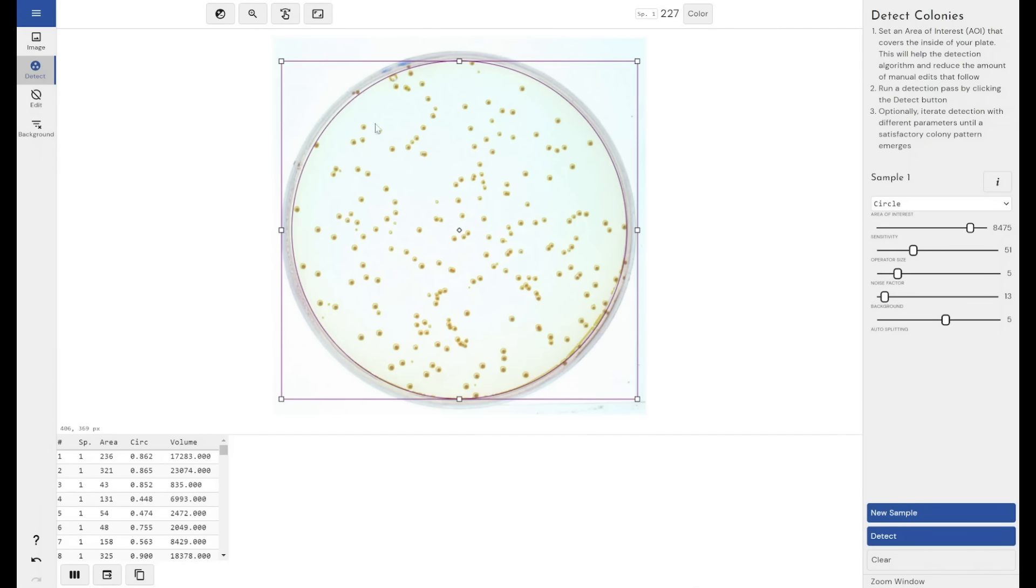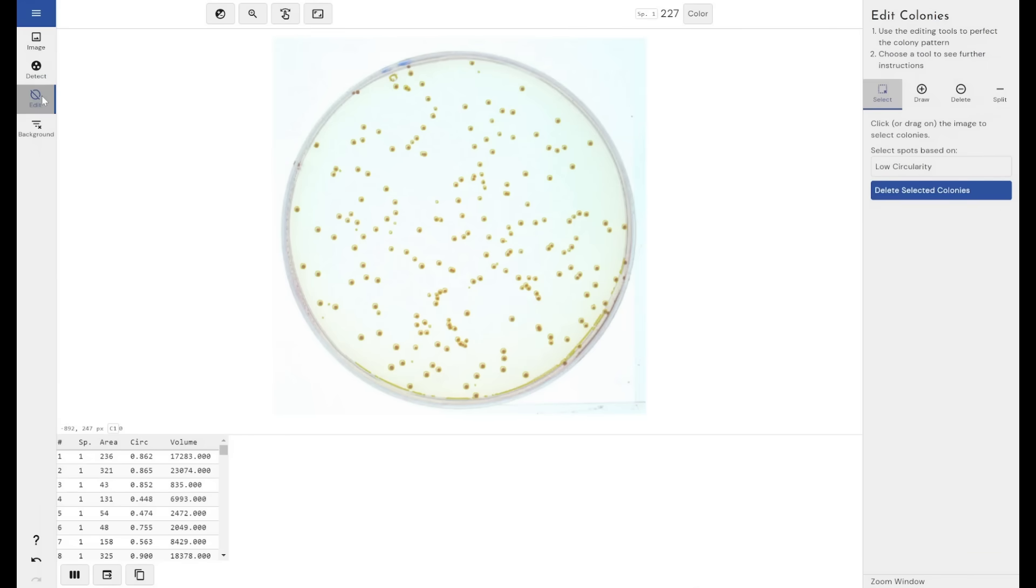You can do this by using different circles, or you can do this manually through the manual editing mode. When we come through to the edit mode, the first option is to select. Just click on one colony.